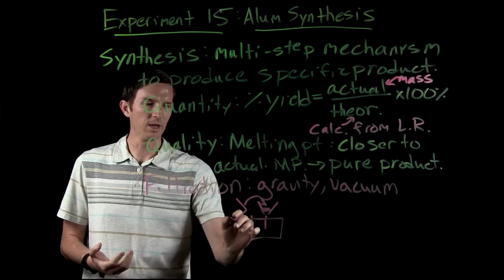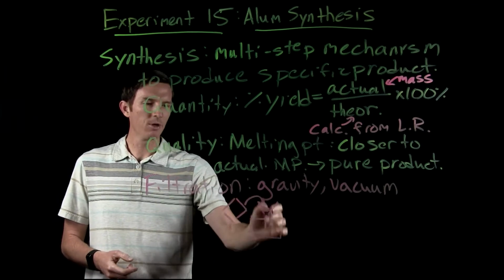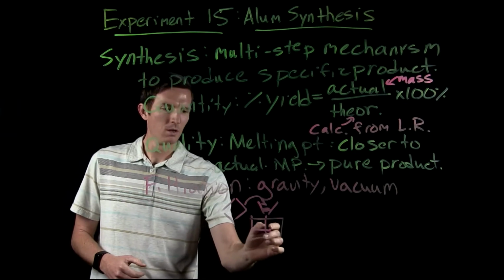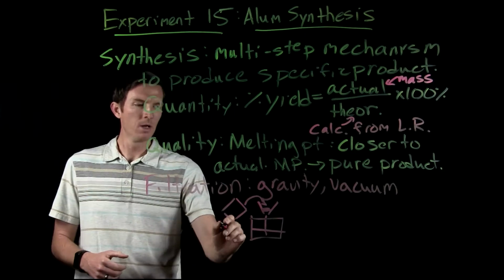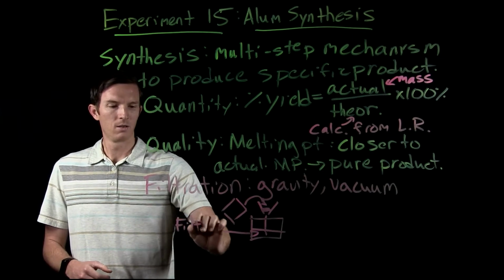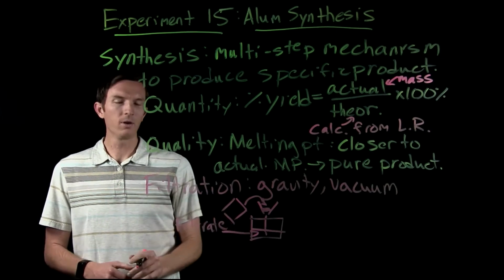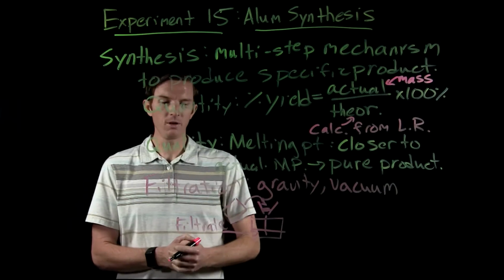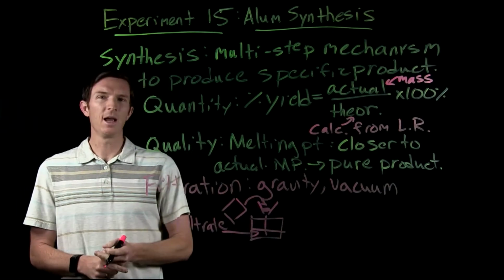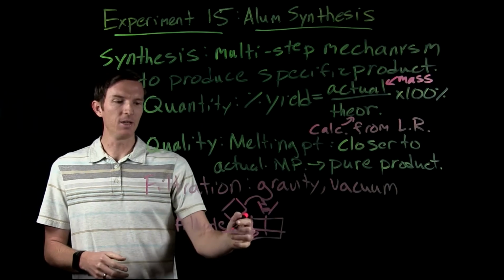Okay, so we have maybe our beaker here, and we go ahead and pour that in. Now, out will come the liquid that comes through. A couple things we can identify here. The liquid left over that goes through our funnel, that's called our filtrate. Okay, so that's the liquid that goes through, and that's what we have at the end.